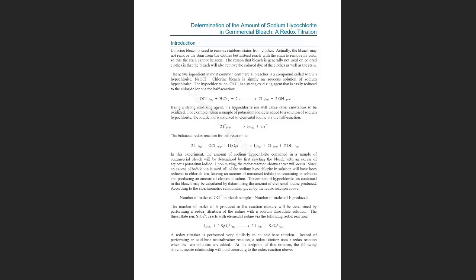Today we will investigate the 10th experiment in Labflow for CHEM 1412, which is determination of the amount of sodium hypochlorite in bleach. The objective of this experiment is to perform a redox titration to determine the amount of sodium hypochlorite in commercial bleach.